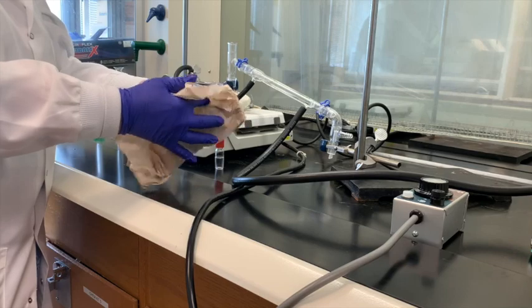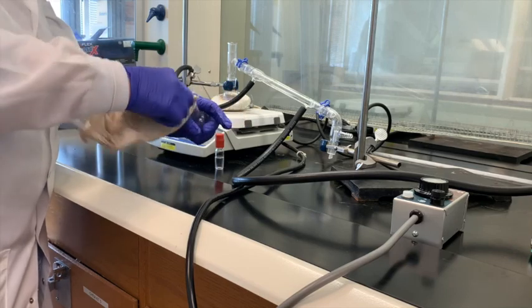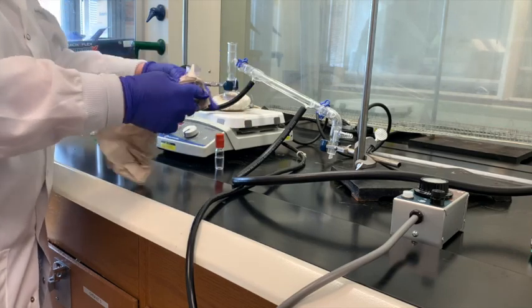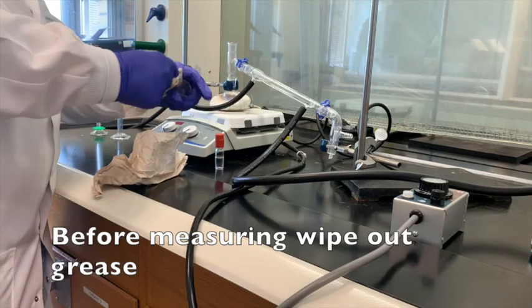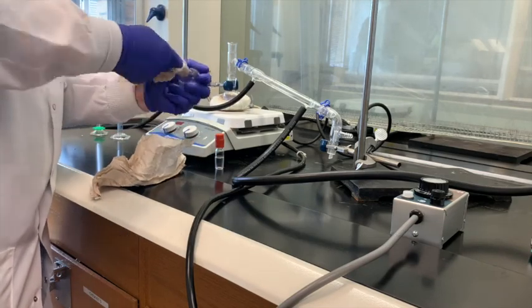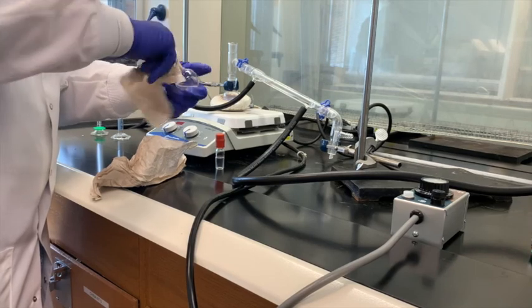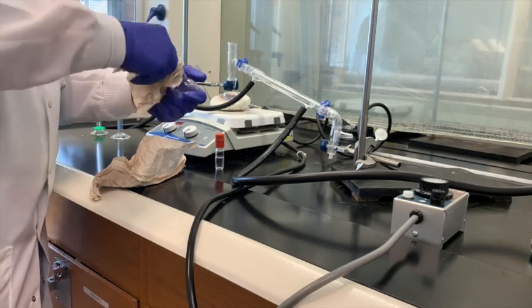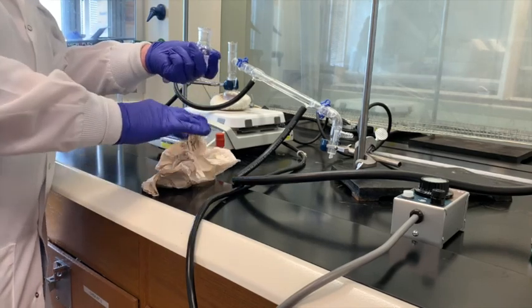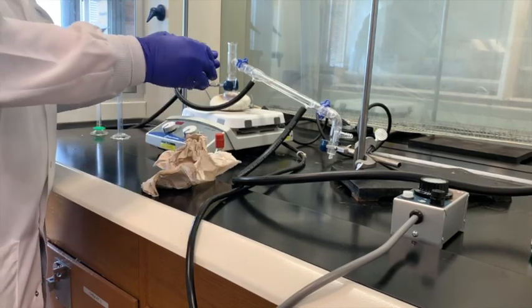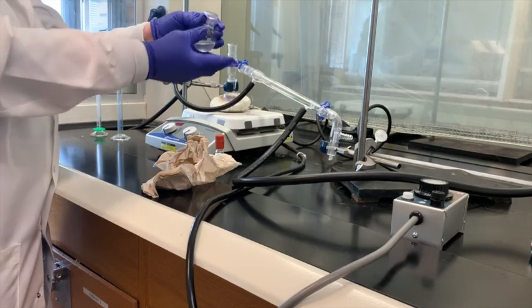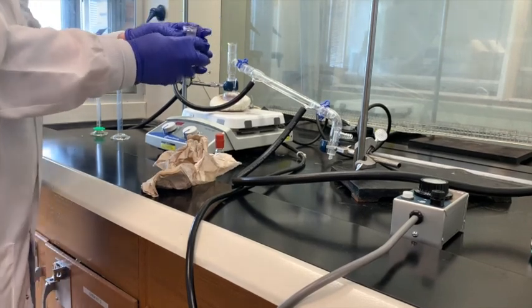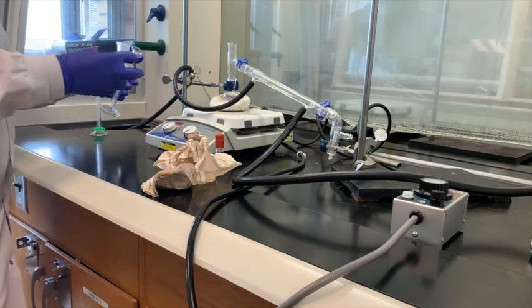This is the distillate that we just collected. I just want to also remind you that when you're separating, remember we had all these joints with grease. Before you do anything, like to measure anything or clean it, make sure that you take paper towel or chem wipes to get that grease out, because if you don't do that and you start to wash it, then that grease will be pushed down in the flask and it's very difficult to remove.